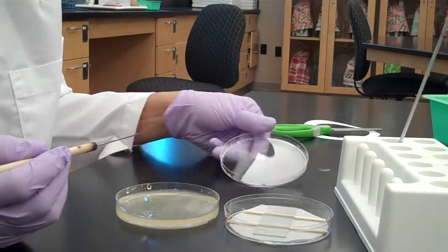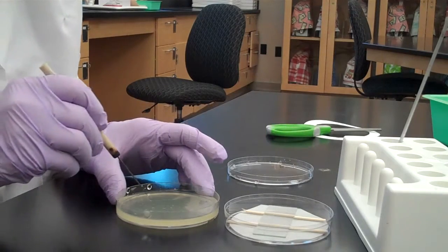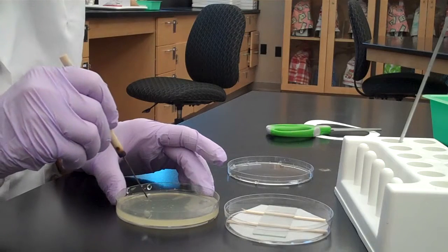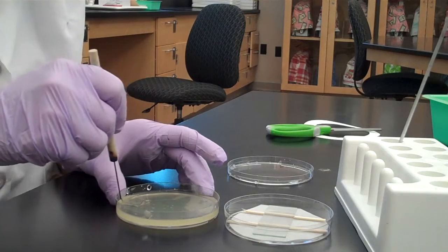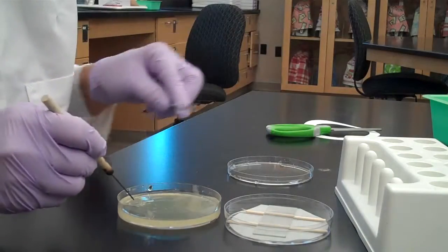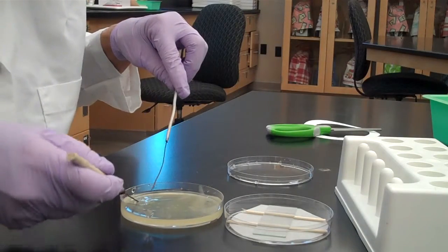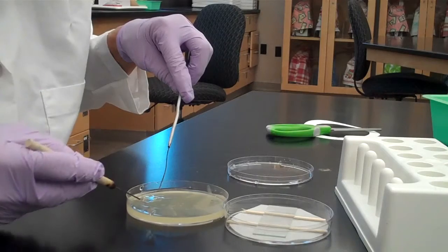Use a sterilizing dissecting needle and cut an agar block out of an SDA plate about the size of a cover slip. Use the dissecting needle and a sterilized loop to move the agar brick over to the slide.